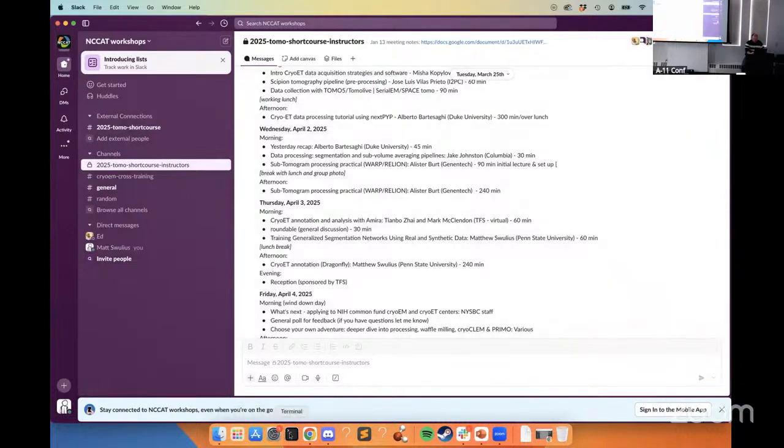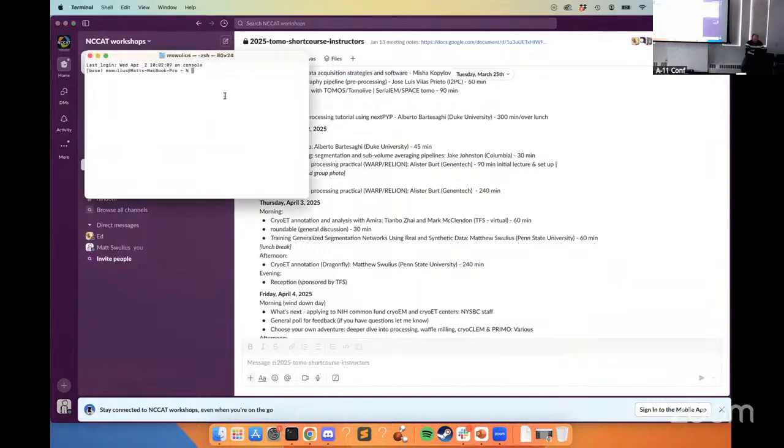All right. What I was going to do, I figure, let me just show you real quick what CTS is like. It runs on any platform as long as you have MATLAB installed, so that's kind of nice. MATLAB is easy to install, so that's kind of nice.